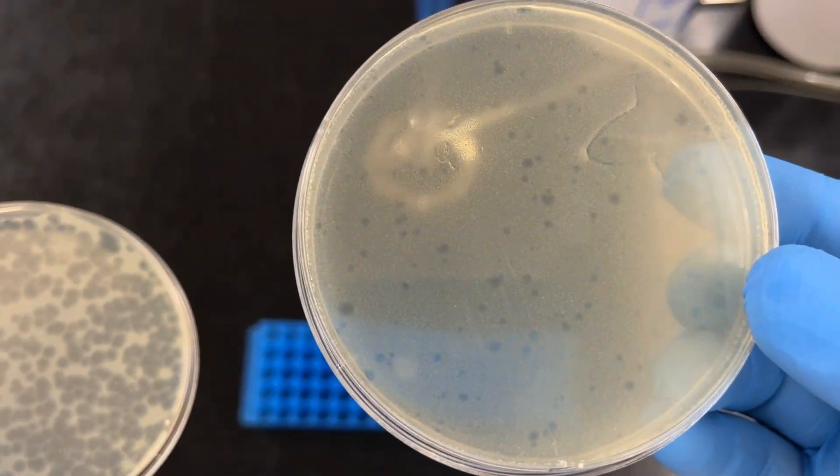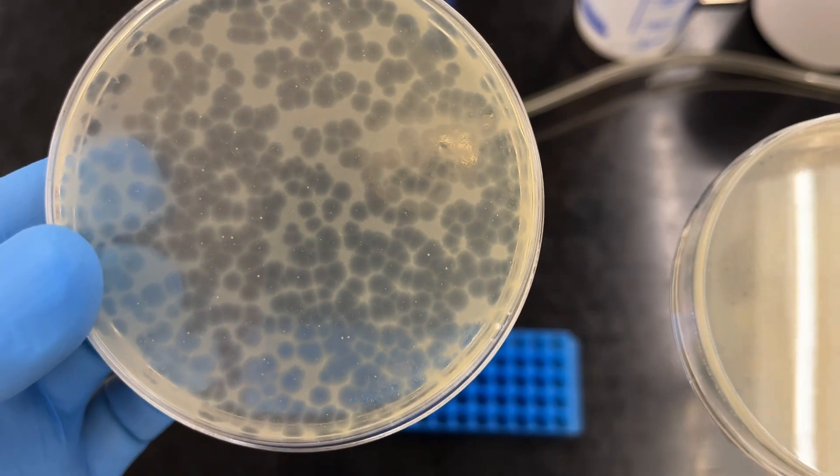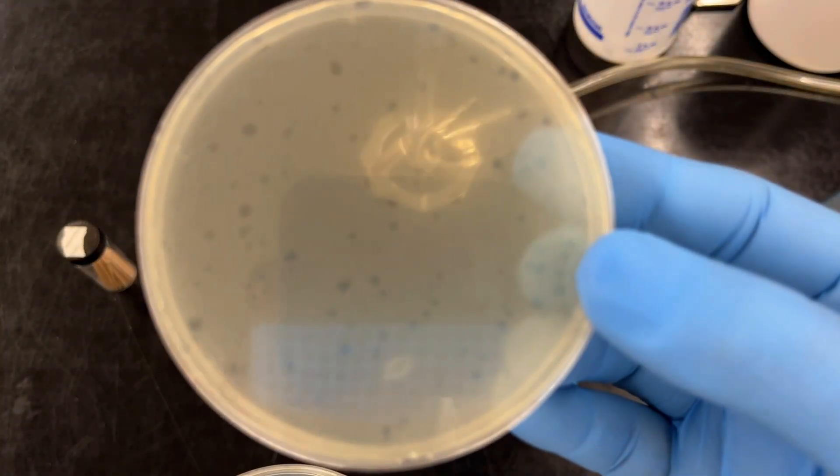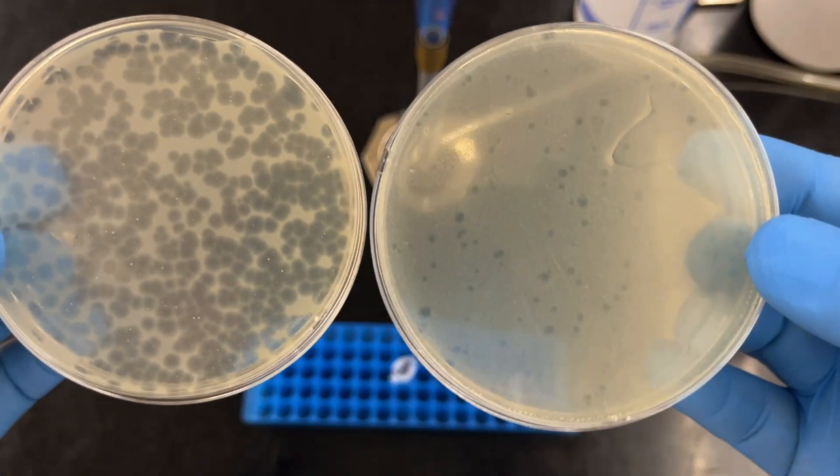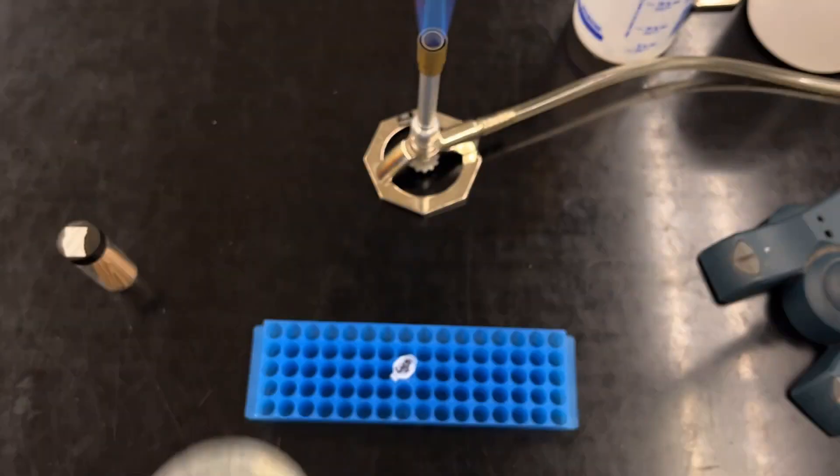And these little holes are what we call plaques, or basically holes in the growth of the lawn. And each plaque represents where a virus has infected and then ultimately burst the cell to create these clearings.